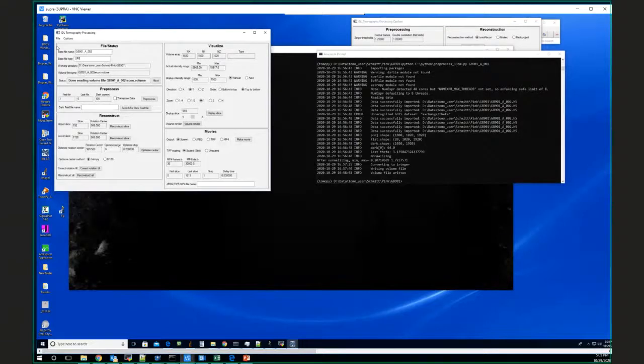Now, I would not promise that we have 1.1 micron resolution. In fact, I know we don't. And that depends a bit on the energy and the thickness of the scintillator. I think we can get 2 micron, maybe 2.5 micron resolution, not at very high energy, but at reasonably low energy, we can get that resolution. So the resolution is more complicated.